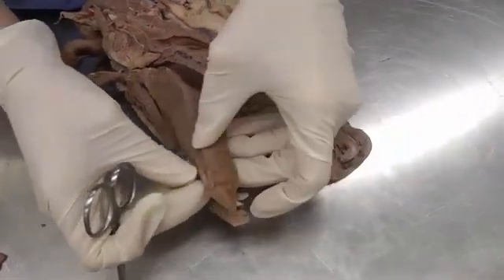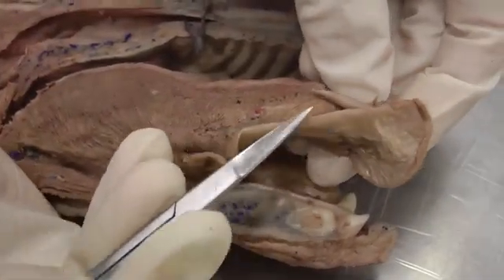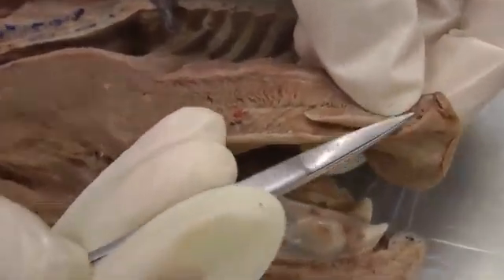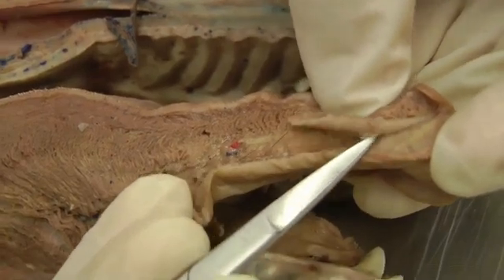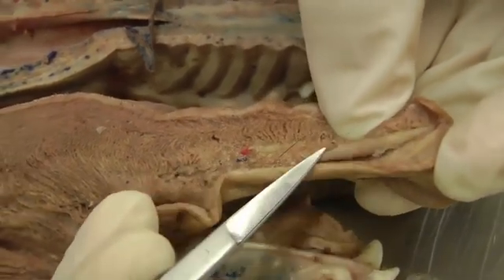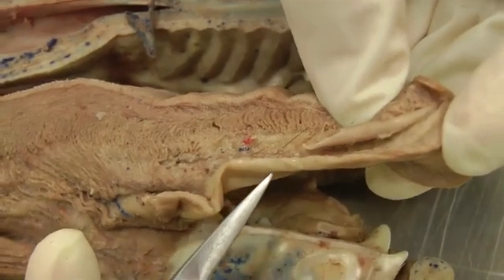The lysa is located in the apex of the tongue. If you slit the mucosa and look on the midline, hopefully you'll find it. My cut went right through the lysa — it's this little structure right here. It's usually easier to see in a dog and sometimes a little difficult in a cat.